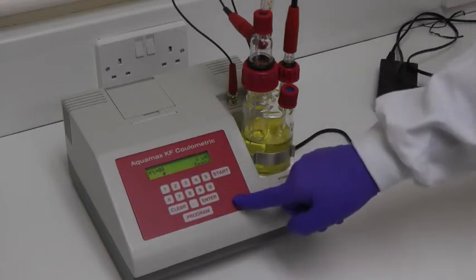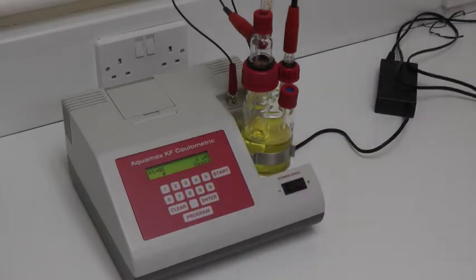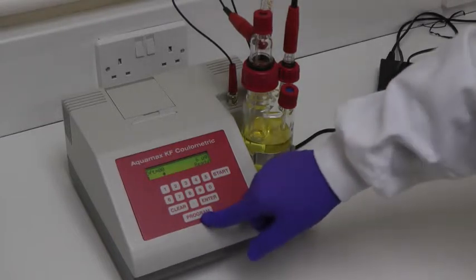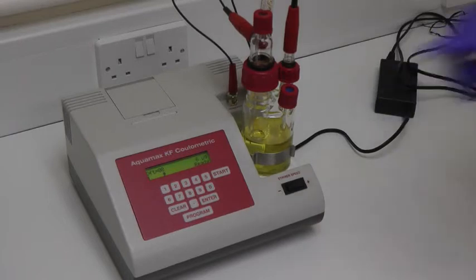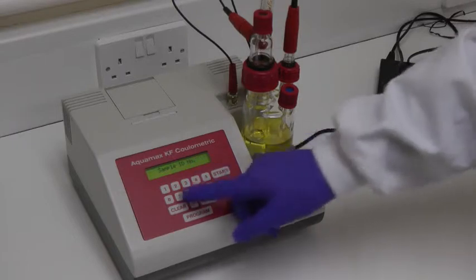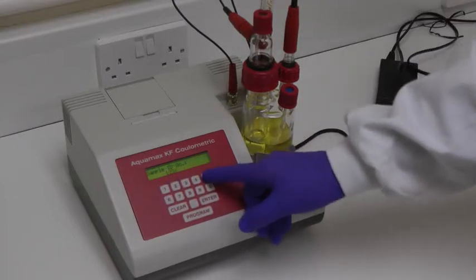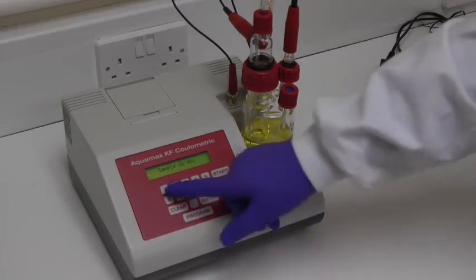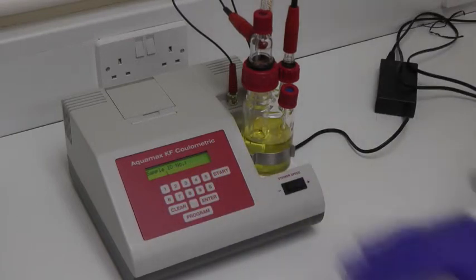Once in ready mode, the keypad is enabled, and the instrument can be programmed. The Program key displays a scrolling list of program parameters, beginning with the sample ID number. This can be up to 8 digits in length. To clear an entry, simply press Clear. To confirm an entry, press Enter.